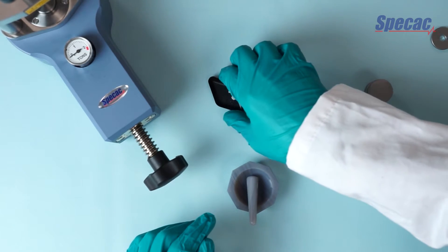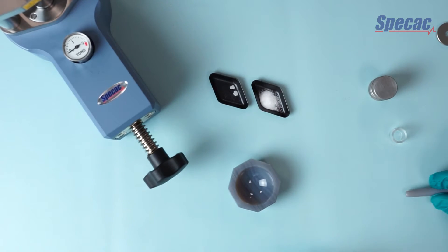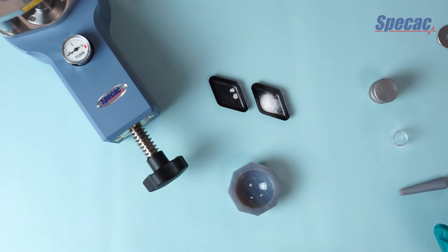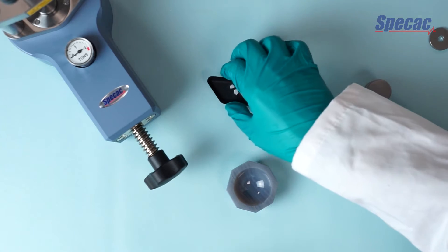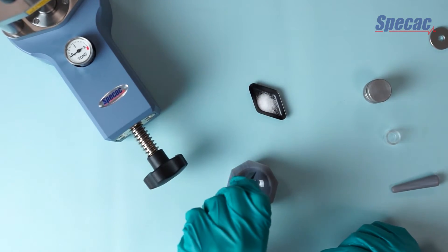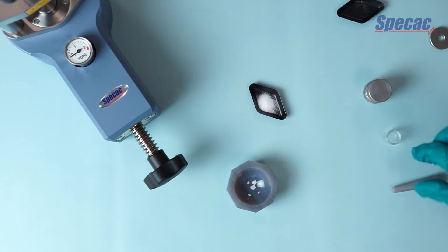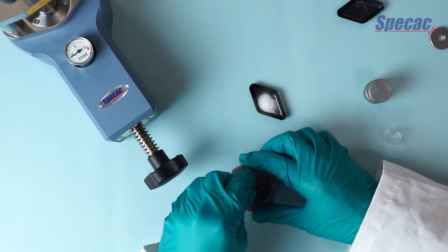Here we are with the Specac Mini Press Pellet Kit. We've pre-prepared KBR powder and stearic acid crystals as the sample. They're pre-weighed in a ratio of about 100 to 1, which is the recommended starting point.